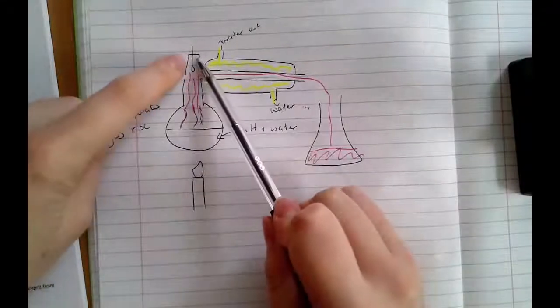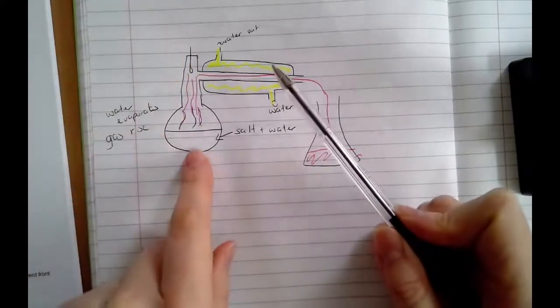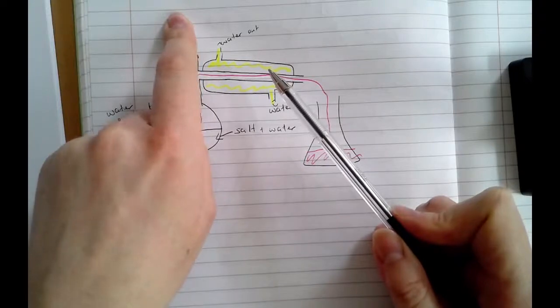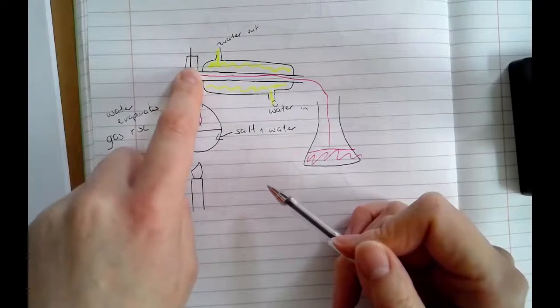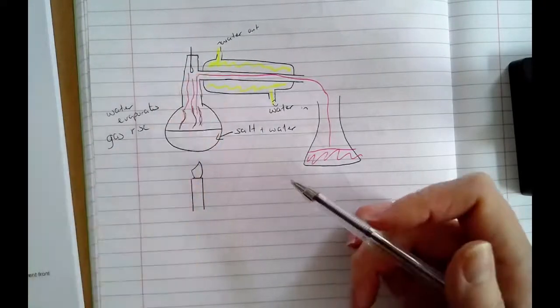You have to seal the container at the top, okay? If you don't seal it at the top, this hot vapor will just rise and escape just as it did in crystallization. So you're going to seal it at the top. This here is a thermometer because I want to see at what temperature my gas is condensing.